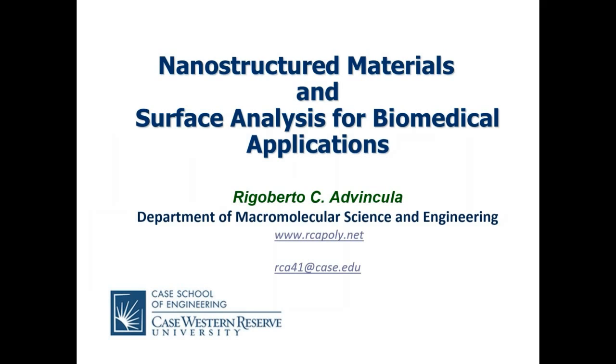Now, in the other coming webinars, we'll be focusing on different topics. Again, anything you'd like to ask or even know more about the coming topics, feel free to communicate with me. Certainly, atomic force microscopy is a very important tool, and we are utilizing it in almost all of the projects that we do in our lab.